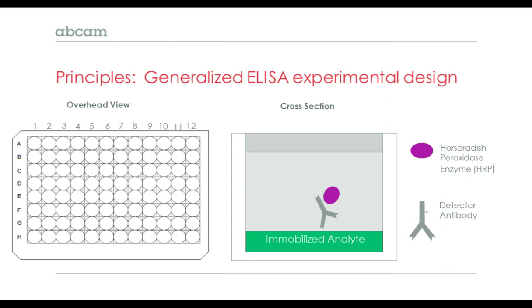We do, however, strongly recommend that each time a sample is run, a standard curve is run in parallel on the day of that assay. It can be difficult sometimes to compare OD values from standards run on different days, and interpolation of data for unknown samples can be erroneous. Therefore, it is strongly recommended that a standard be generated each and every time.